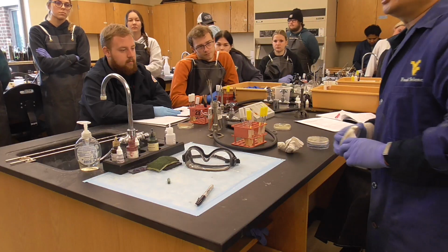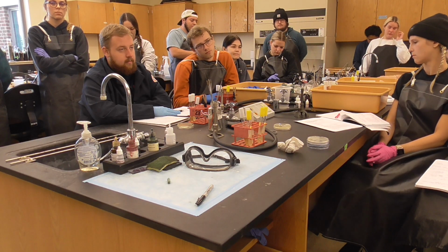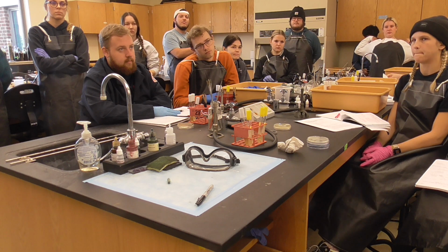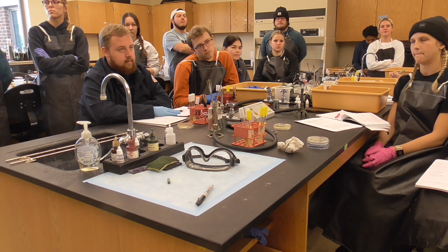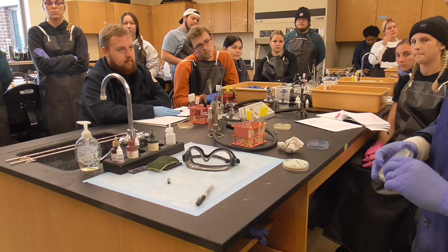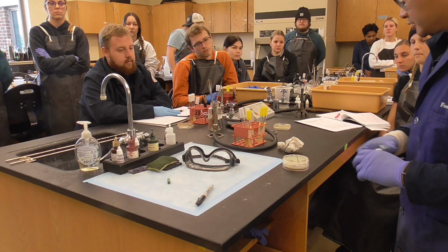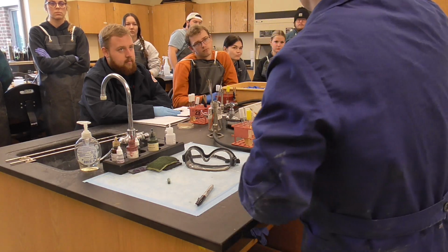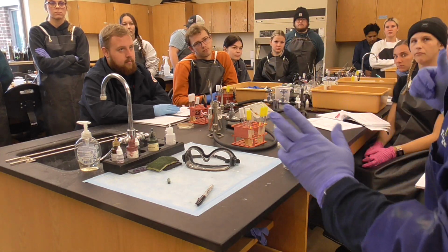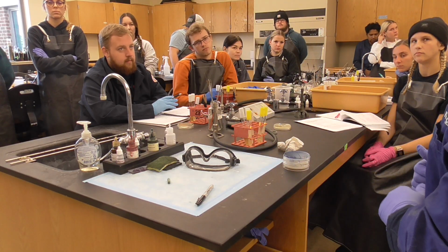Now, this is a skim milk agar. For skim milk agar, you do E. coli and Bacillus subtilis. This is the one which is E. coli and Bacillus subtilis. This is the one also E. coli and Bacillus subtilis. But for one bench, we can have one student do E. coli and Citrobacter, to see what it looks like.